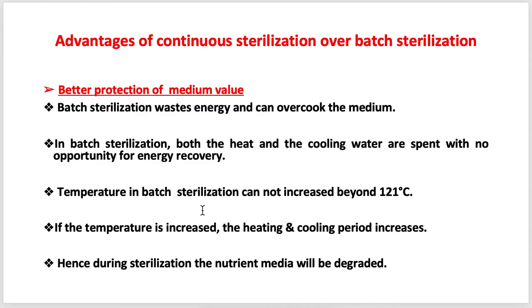And if the temperature is increased, the heating and cooling period will also increase. Hence, during the sterilization, the nutrient media will be exposed to the heat for a longer time. Thus, the quality of the nutrient media will be degraded.